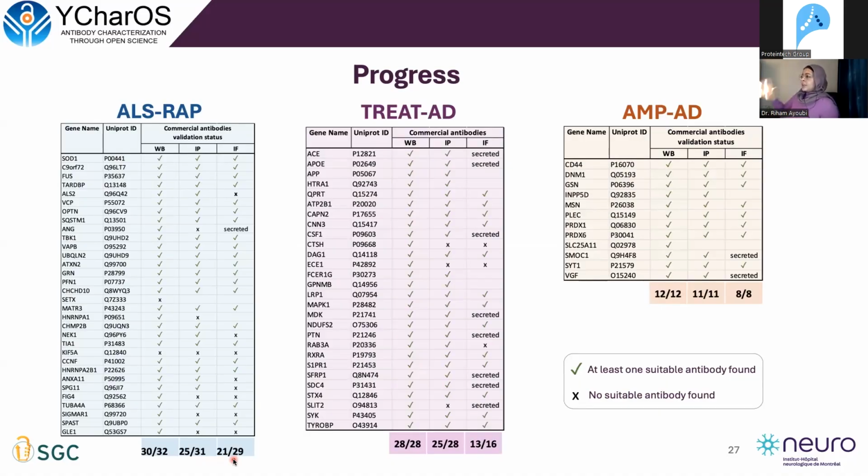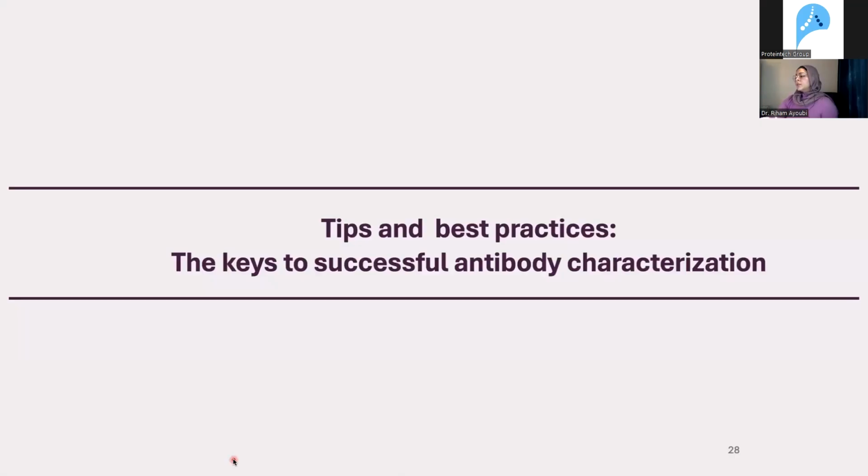While a collection of 106 reports is available to help guide the scientists in choosing the best tool, our collection is still limited. However, we can still share what we learned from this subset of targets. This is why I will now point out a few important aspects for your consideration when choosing and working with antibodies against your protein of interest.